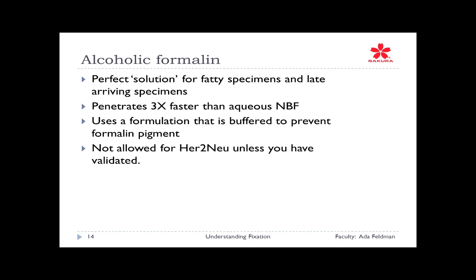And one of them is using alcoholic formalin, all right? Years and years ago, it was the most popular solution. Not only as a solution in terms of it being a liquid, but the answer for fatty specimens, and those things coming in late in the afternoon, all right? It actually penetrates the tissue 3 times faster than the water-based aqueous neutral buffered formalin, all right?